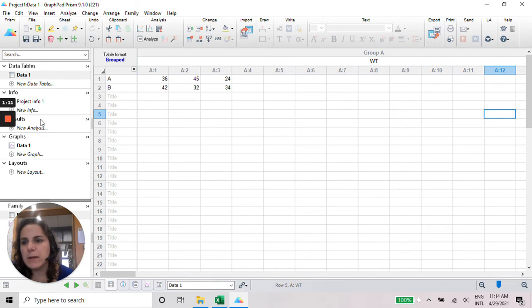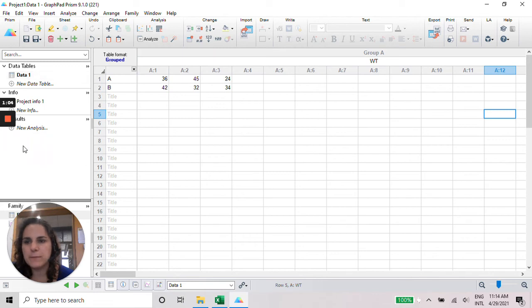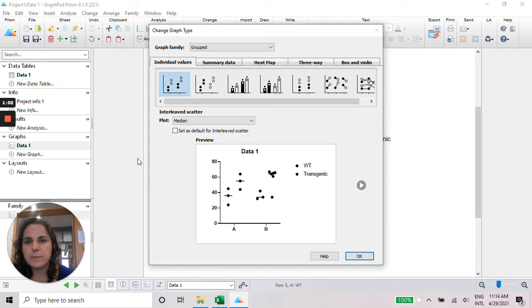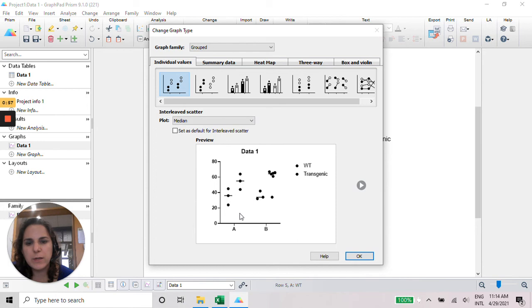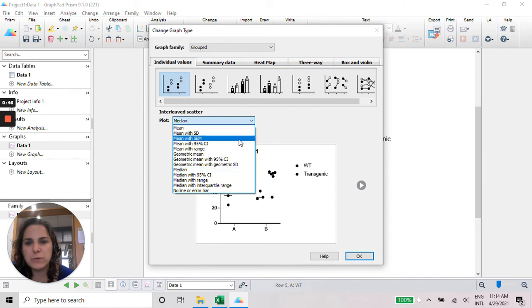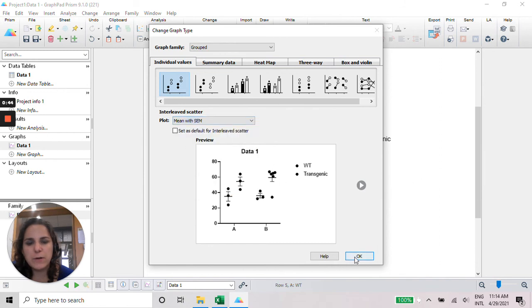Okay, and then I go now for the data one graph. That is this one. And as I want a scatter plot, I'm going to use the individual values. And as I can see, this is the treatment A, treatment B for transgenic and wild type.